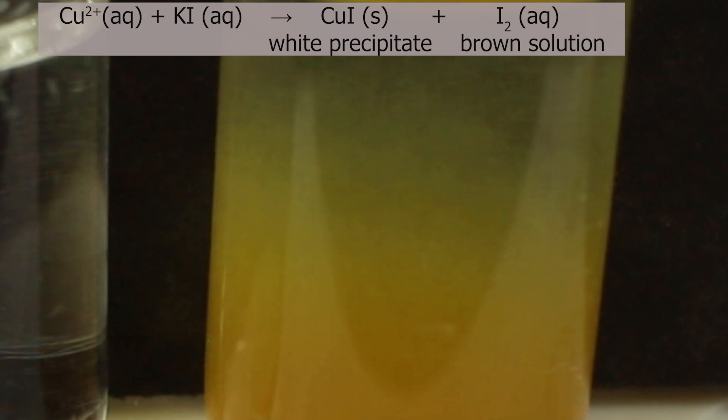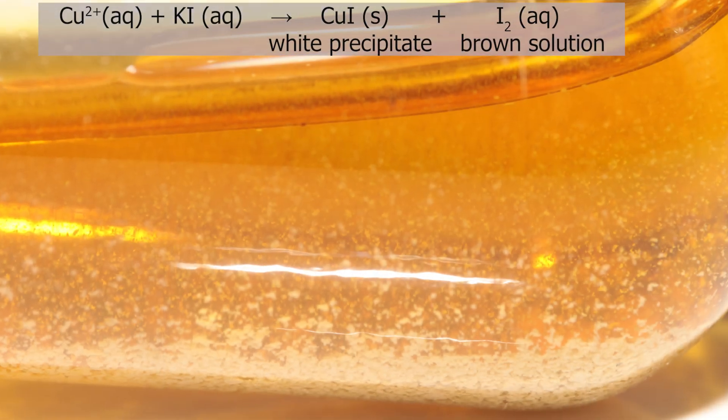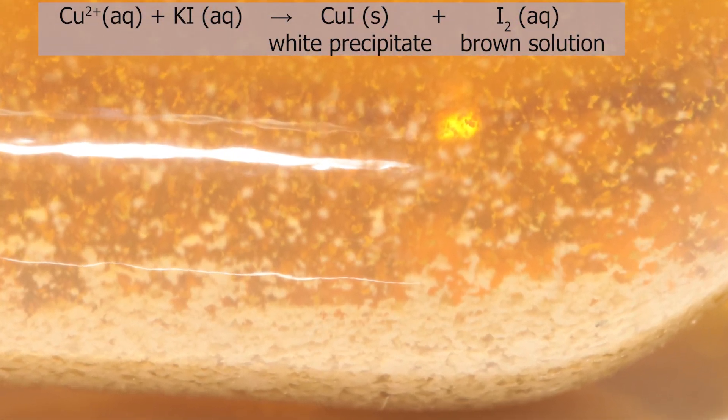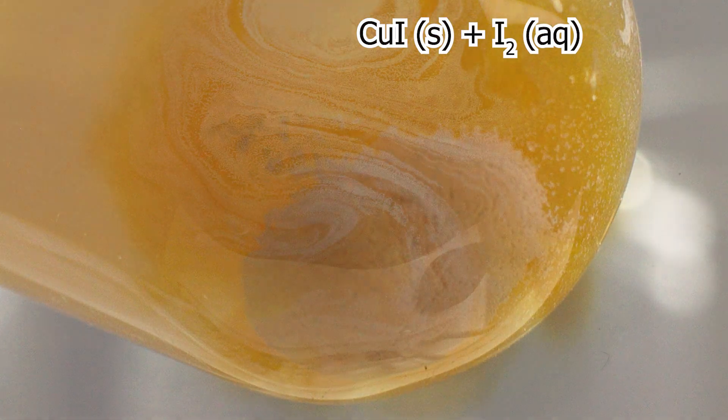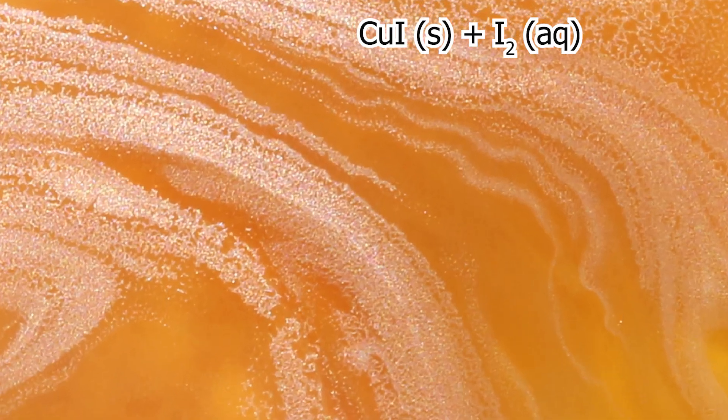White precipitate is copper I iodide which is insoluble. You have to wait a little for this precipitate to settle, then you see it clearly. Precipitate is necessary because iron III for example also oxidizes potassium iodide to iodine, but it doesn't form white precipitate.